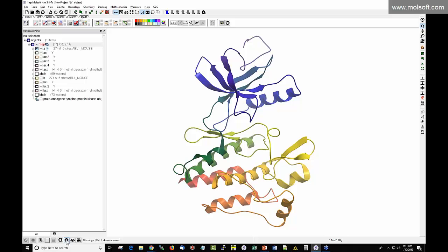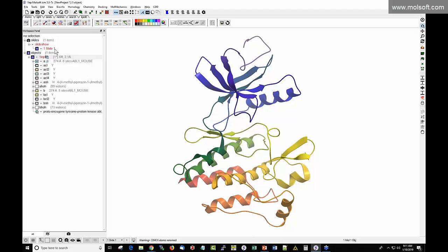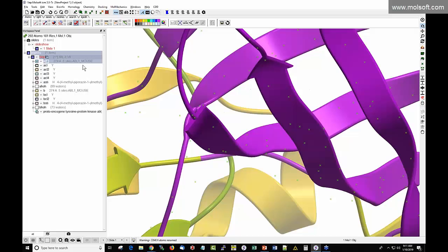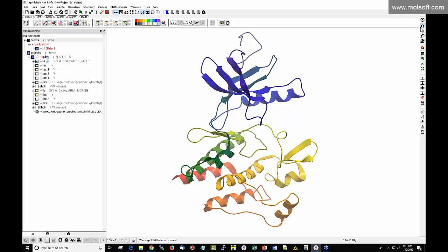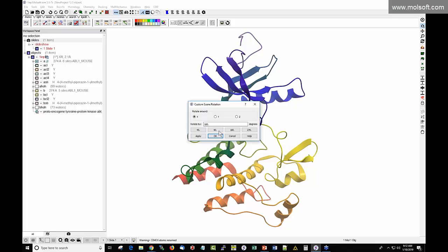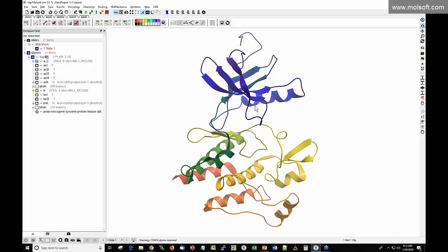Click the slide button at the bottom to save this view to a slide in the ICM workspace. Slides remember the exact representation you had. You can also customize rotation by clicking-and-holding the rotation button and rotating by 90 degrees around the Y-axis, Z-axis, or X-axis. The translation and zoom buttons are available, or use the hot zone on the left side of the graphics to zoom in and out.